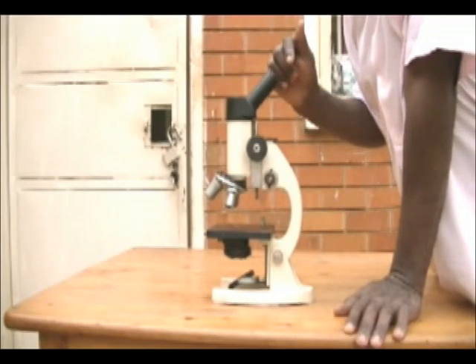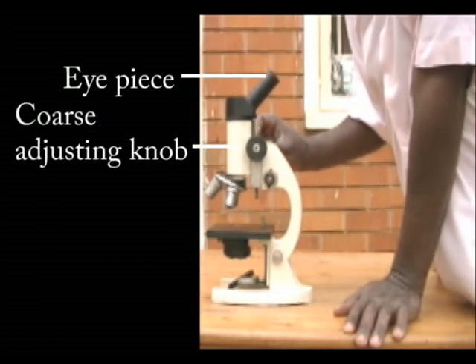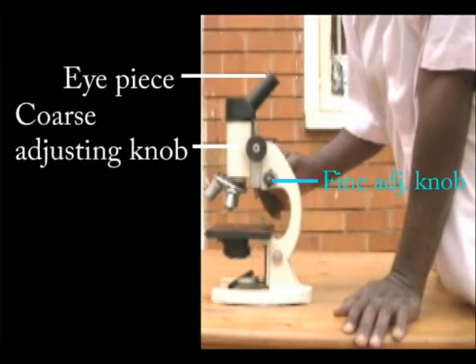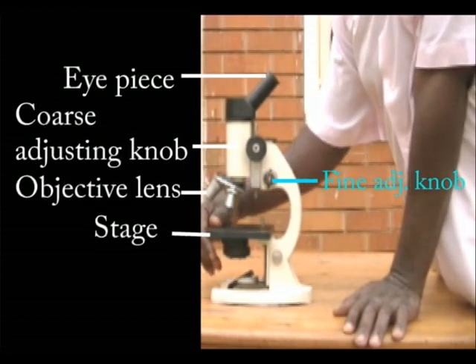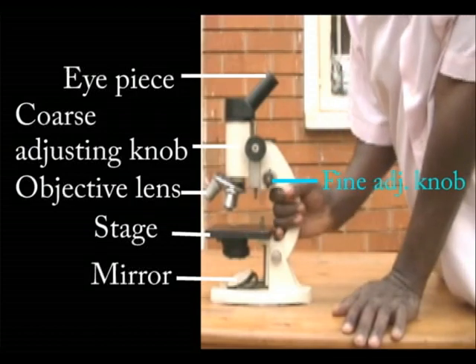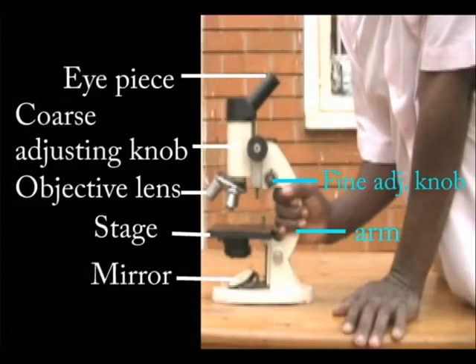Parts of a microscope. This is the microscope, this is the eyepiece, this is the coarse adjusting knob. It helps us focus the specimen. This is the fine adjusting knob, also helps us to focus the specimen. This is the stage where we place our specimen. This is the mirror, it focuses light through the specimen. This is an arm, it helps us to carry the microscope.